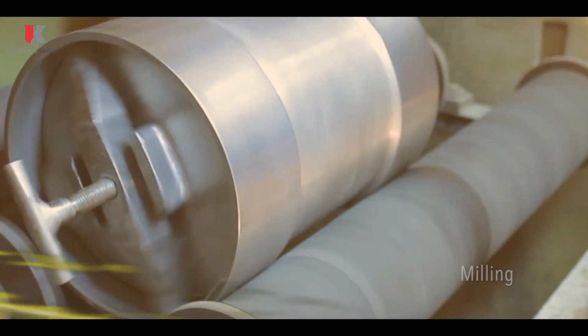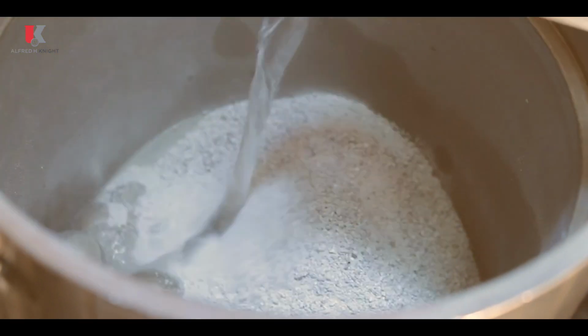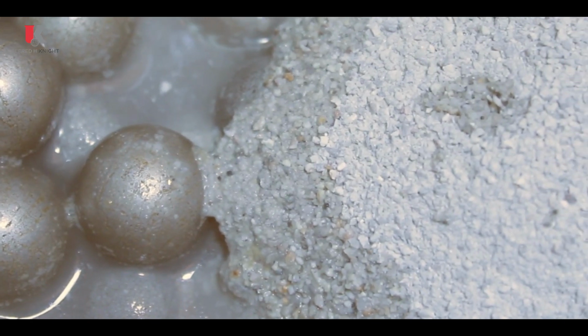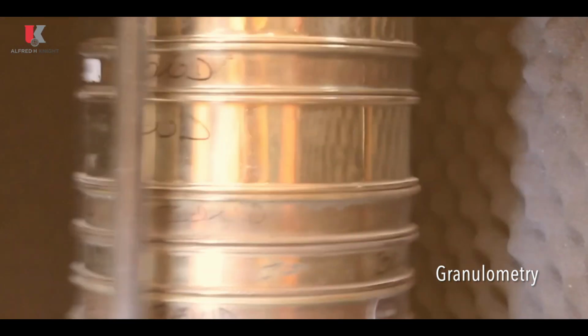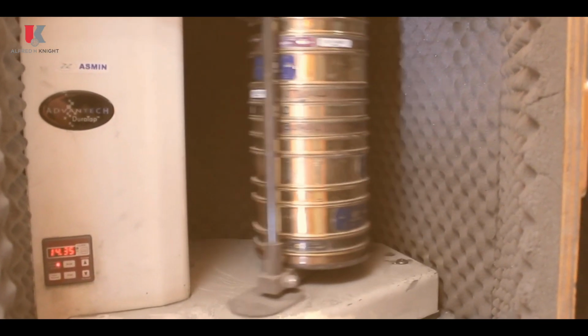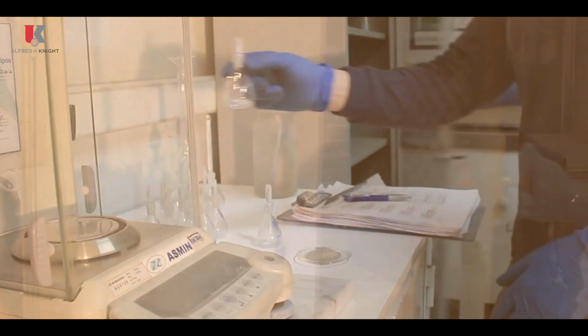Milling. The objective is to prepare the ore sample with the required particle size for the flotation tests. To obtain this particle size, the grinding curve of the ore is previously studied. Granulometry, used to measure the size distribution of a particular sample, characterize the samples to be studied in each test, and to control the crushing and grinding processes.